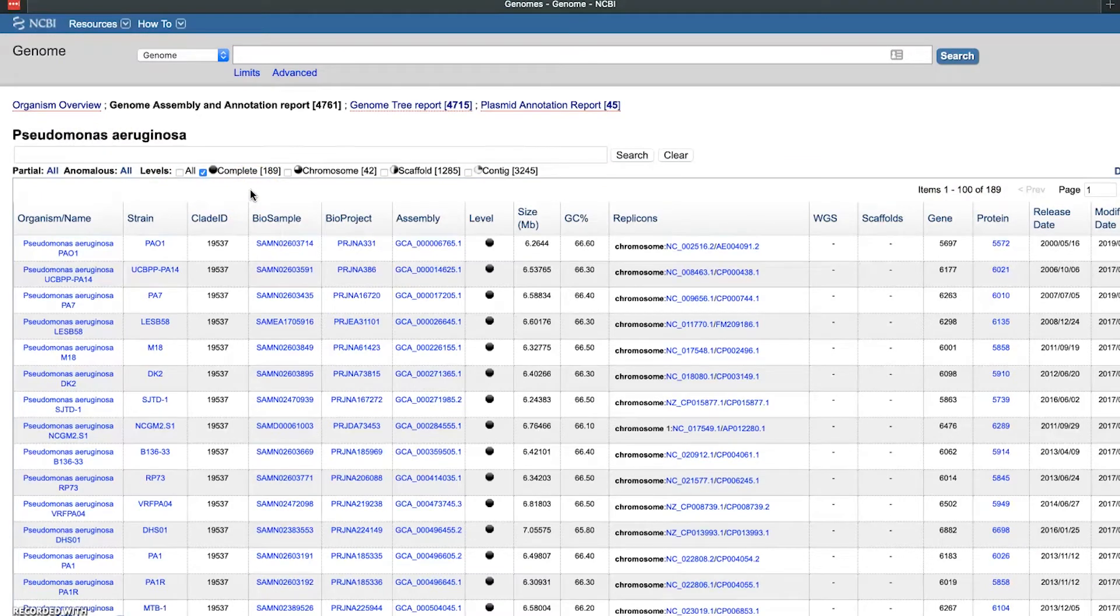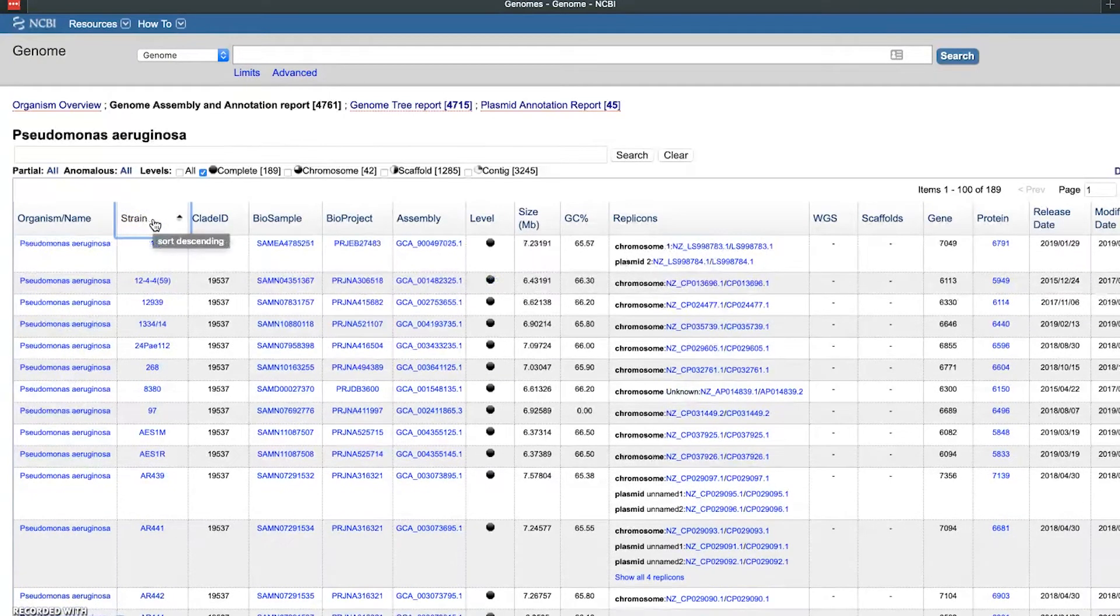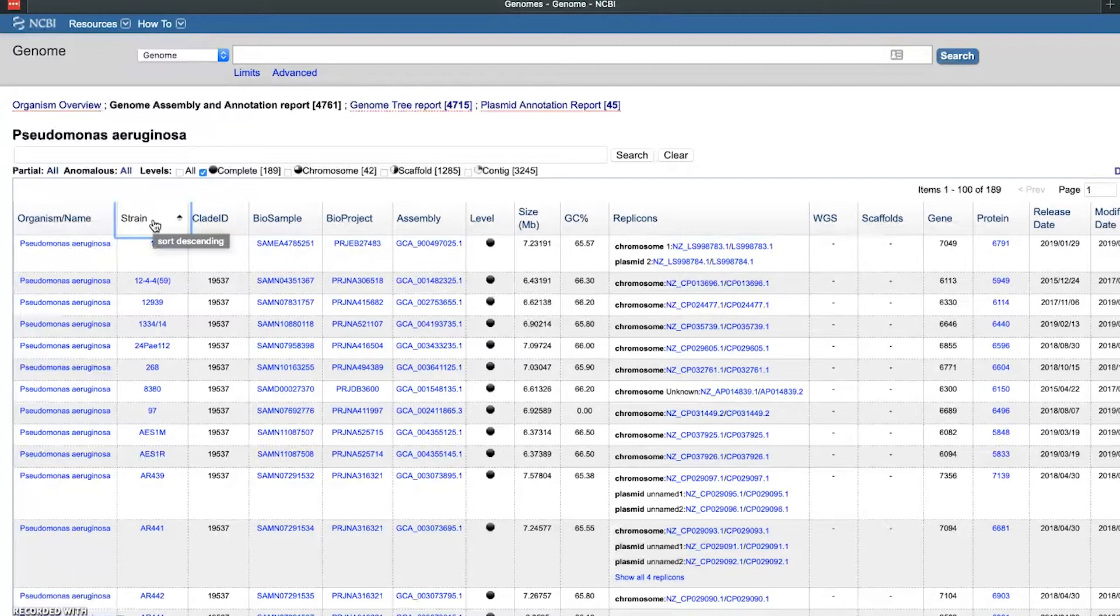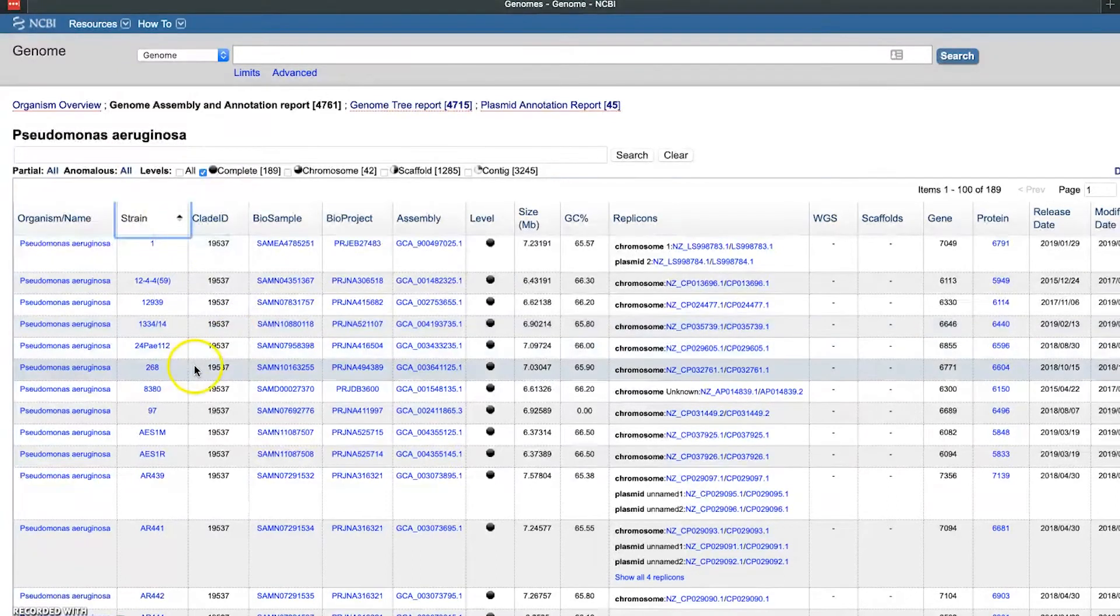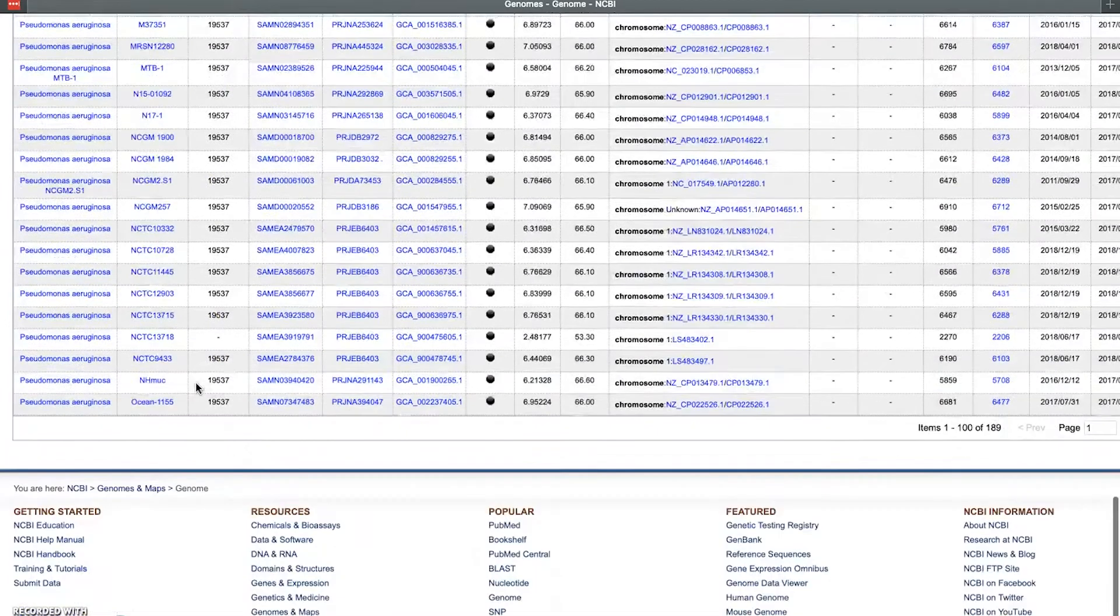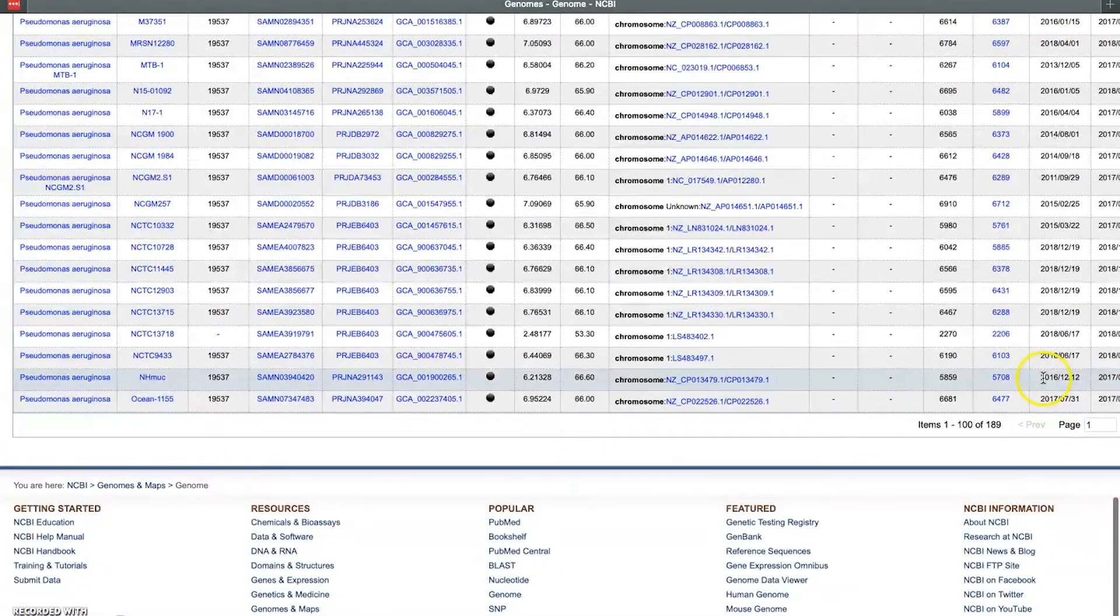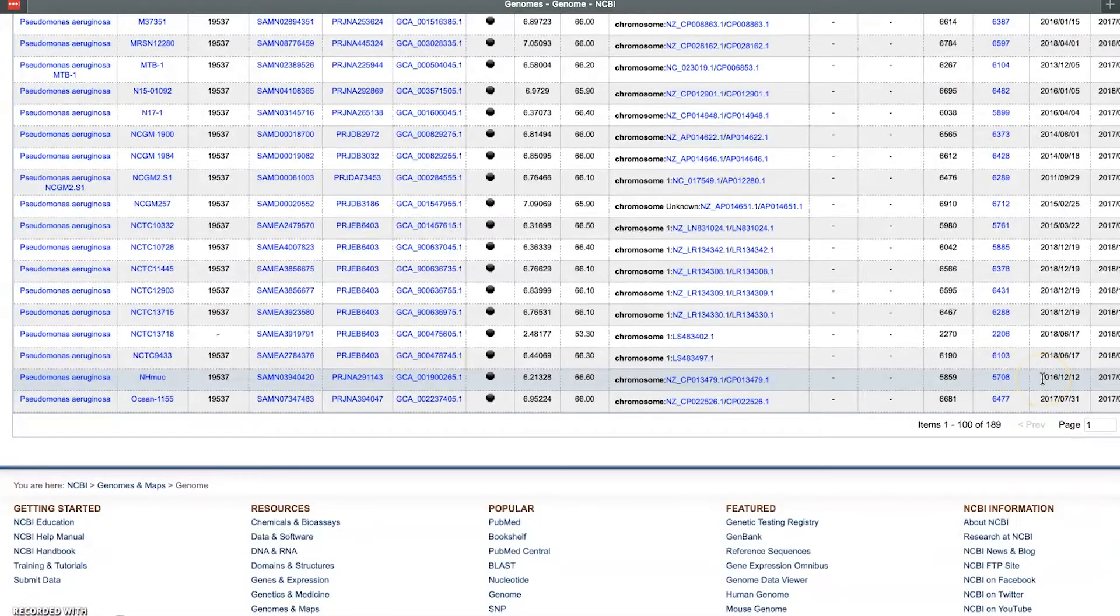So what's left here are just the fully finished complete genomes. These are probably all candidates for a really nice reference genome. What we'll do next is sort - we'll rank order these, sort descending by the strain column, and then what we want to do is search for or scroll through here until we find it.